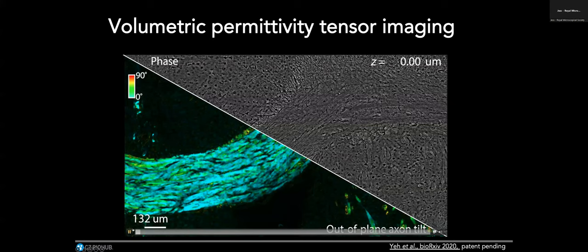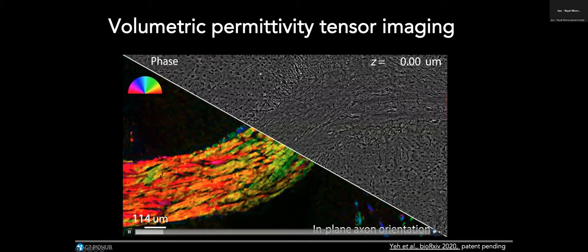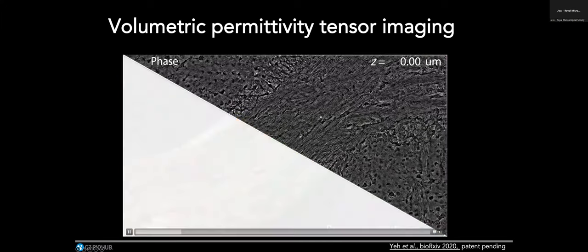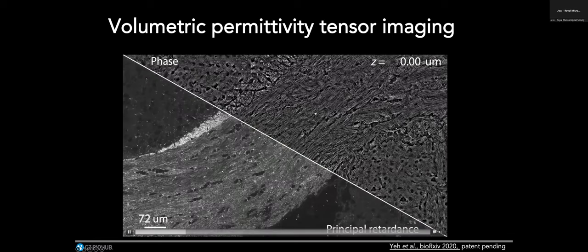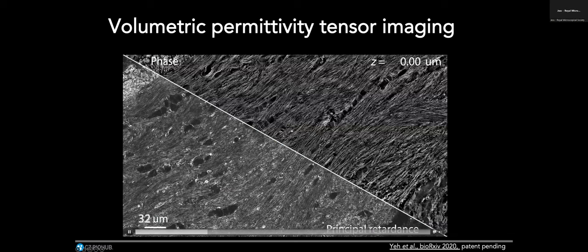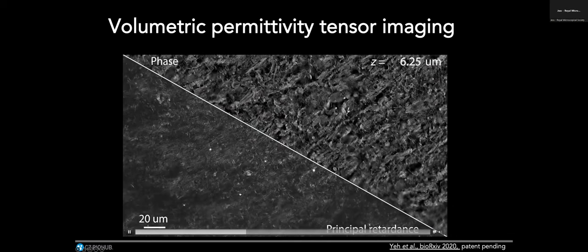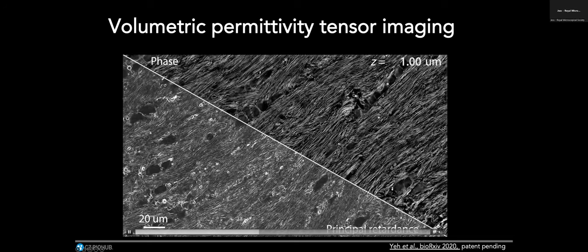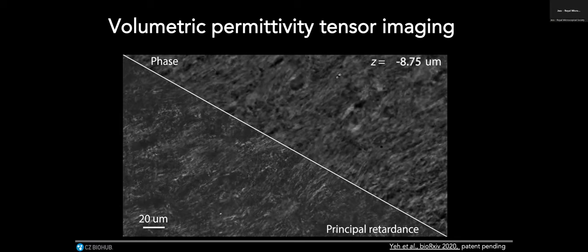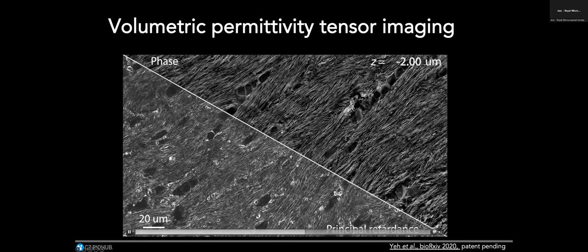And as the movie plays, one can see different parts of the tissue. You can see nuclei again, darker than the surrounding. And now, as we zoom in, we begin to resolve specific bundles and the boundaries of the axon. Some of the axons are optically sectioned in a transverse direction, and some are optically sectioned in the longitudinal direction.